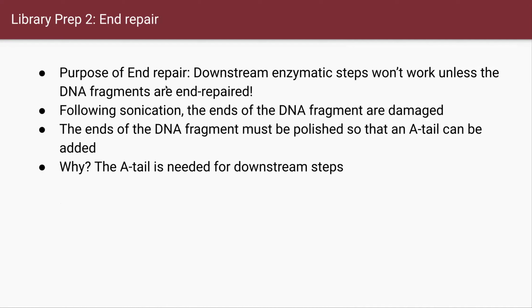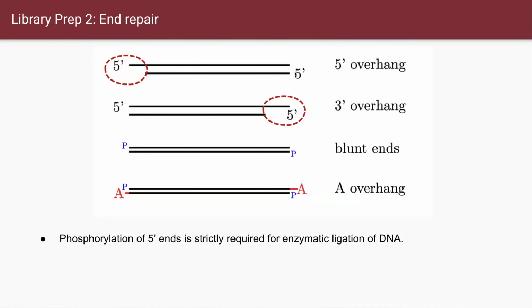So why are we doing this fragmentation? Because we want to do the adapter ligation at the end of each fragment, right? Once you synthesize a DNA sequence, like in nature, you use phosphorylation and ligation. In replication, you always use the phosphorylation at the end of the fragment, then you add the new nucleotides onto that.